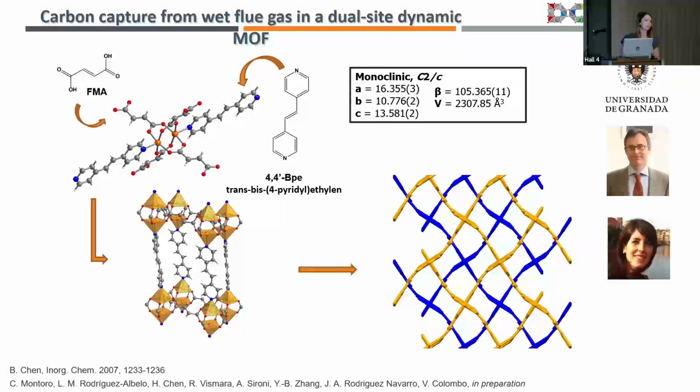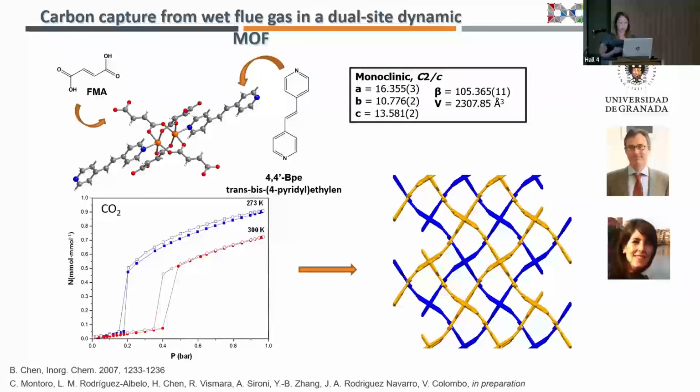And the first one deals exactly with the laboratory-scale conditioning chambers we have in our laboratory that we have used to determine the key properties of a material that has shown to be able to capture CO2 even in the presence of water. So this means that in this case, you will see a simple experiment performed in the laboratory that has given us the key information for solving this experimental problem.